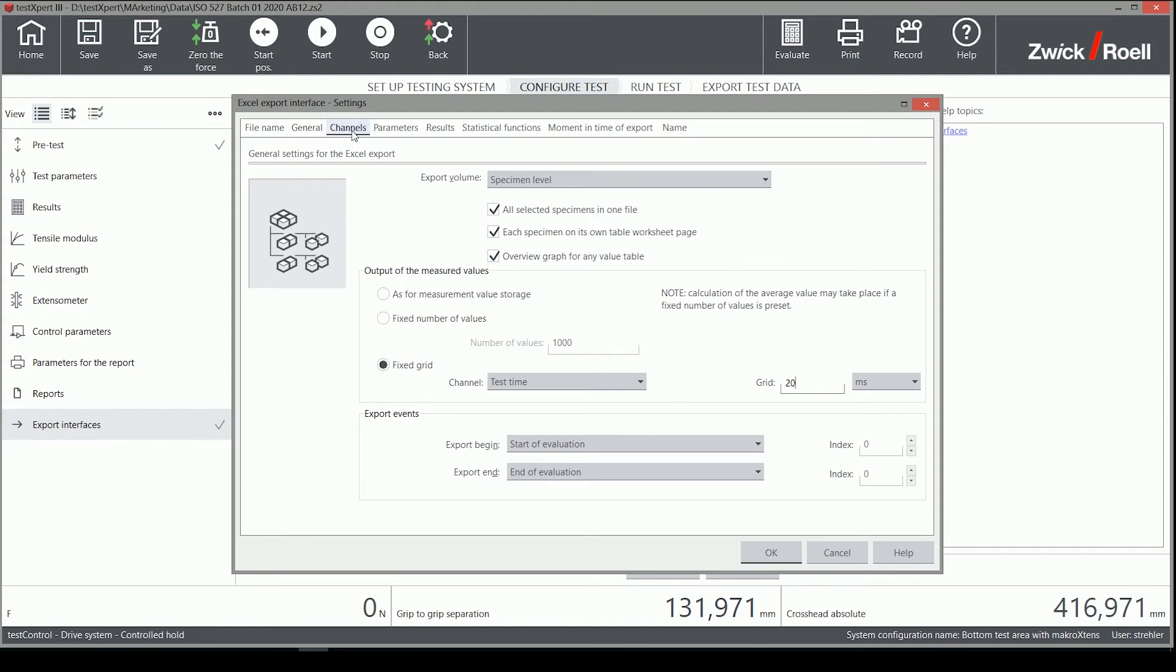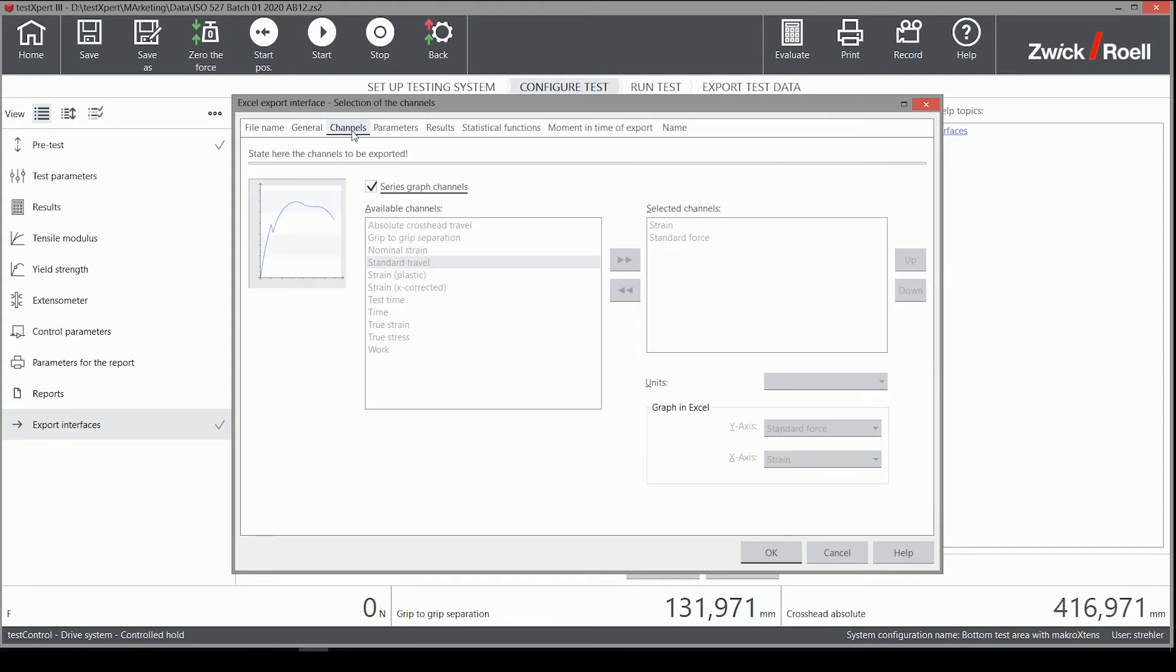On the channels tab, we can now select which measurement channel we want to export and in which unit.